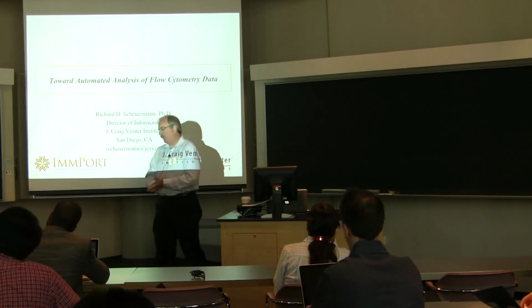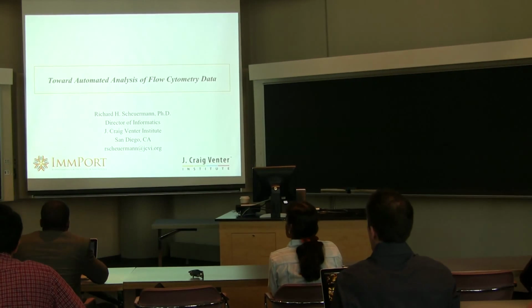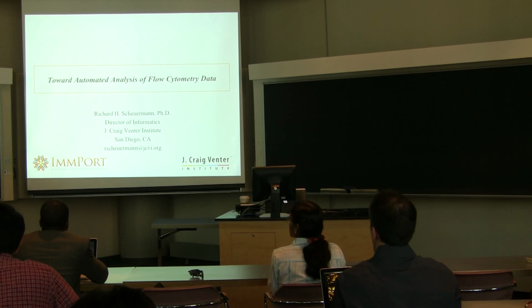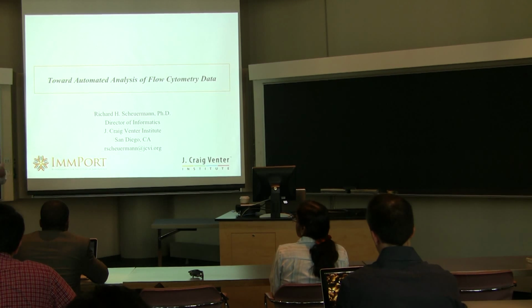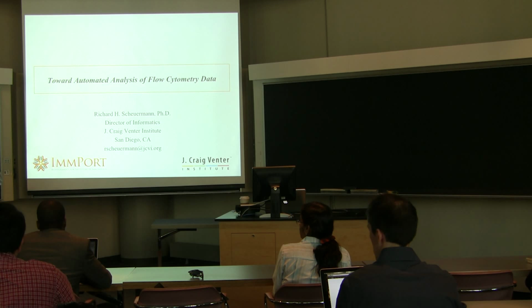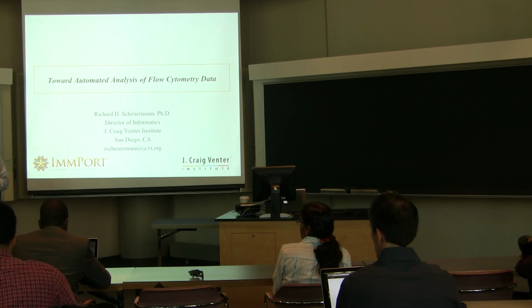So today, for I guess the whole morning, we're going to be talking about flow cytometry data analysis. And the way that we have it organized is that we're going to spend the first hour in the lecture hall, and we're going to give you an overview about what are some of the challenges in handling and analyzing flow cytometry data, and give you an overview of a couple of different methods that have been developed to take more computational approaches to assist in the analysis of flow cytometry data.